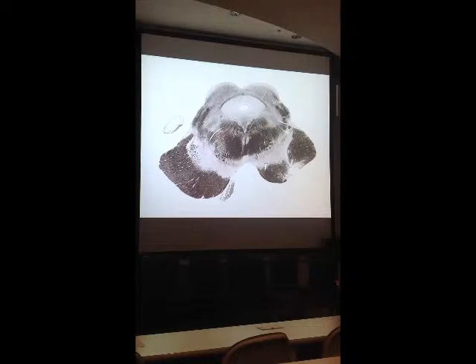If you follow these dark streaks back, they lead to a not well-defined, but sort of well-defined nuclear group, the oculomotor nucleus complex, and that goes along with the third nerve. And in lecture, you might have to know about the part of the oculomotor nucleus complex that's made up primarily of preganglionic parasympathetic neurons whose axons help to make up the third nerve, and that's the Edinger-Westphal nucleus. You don't see it here.